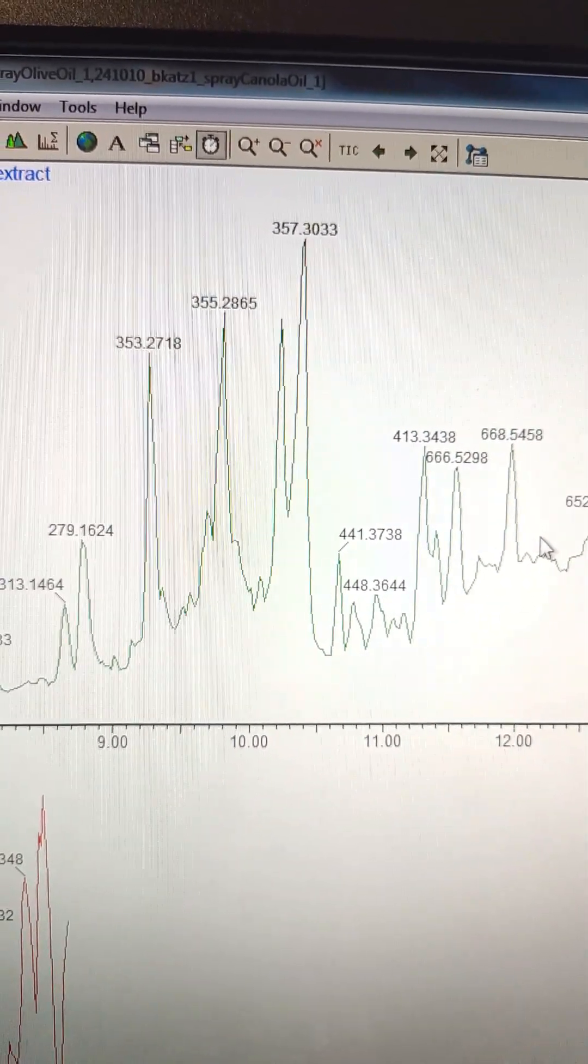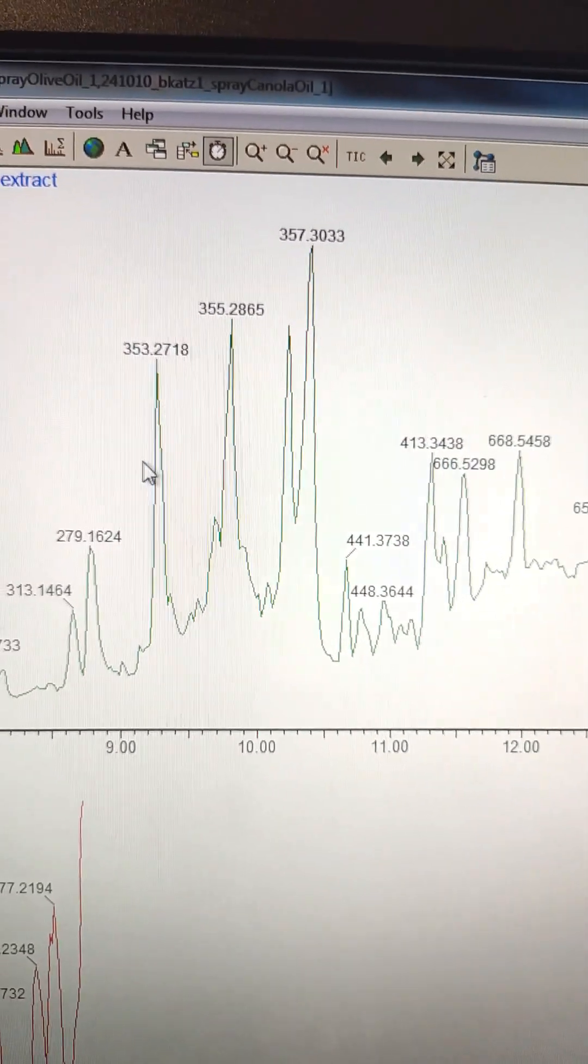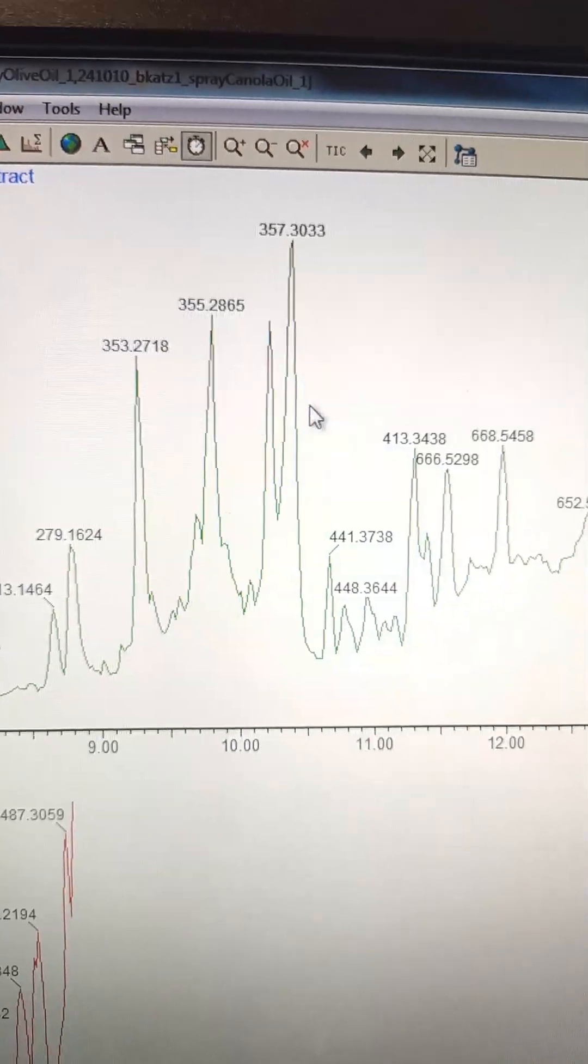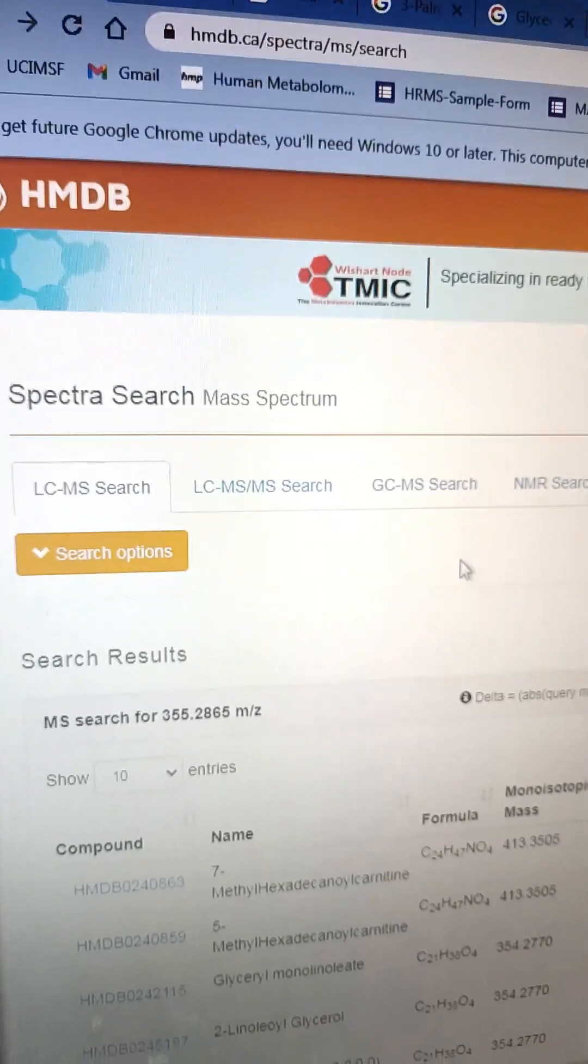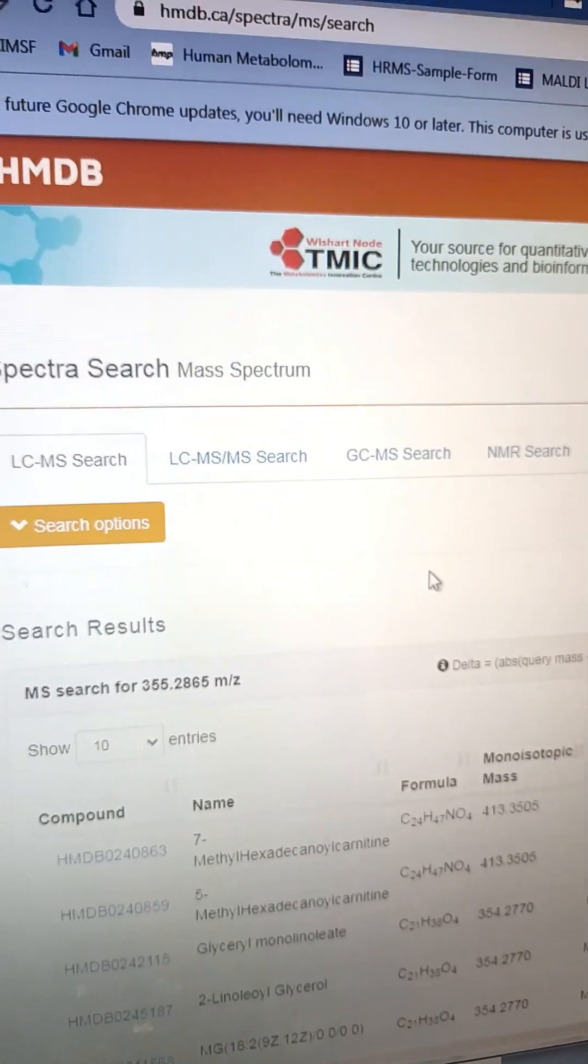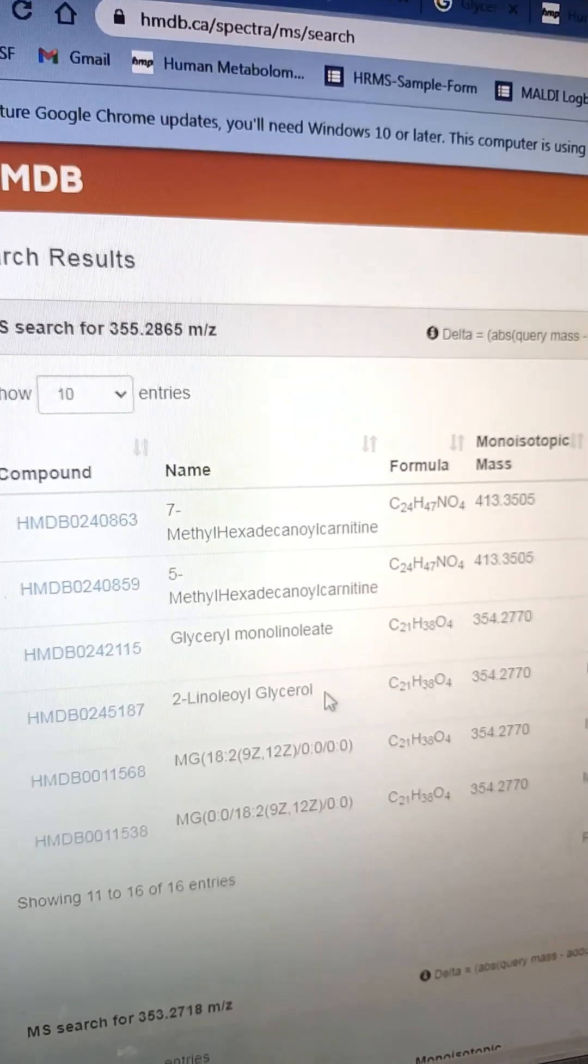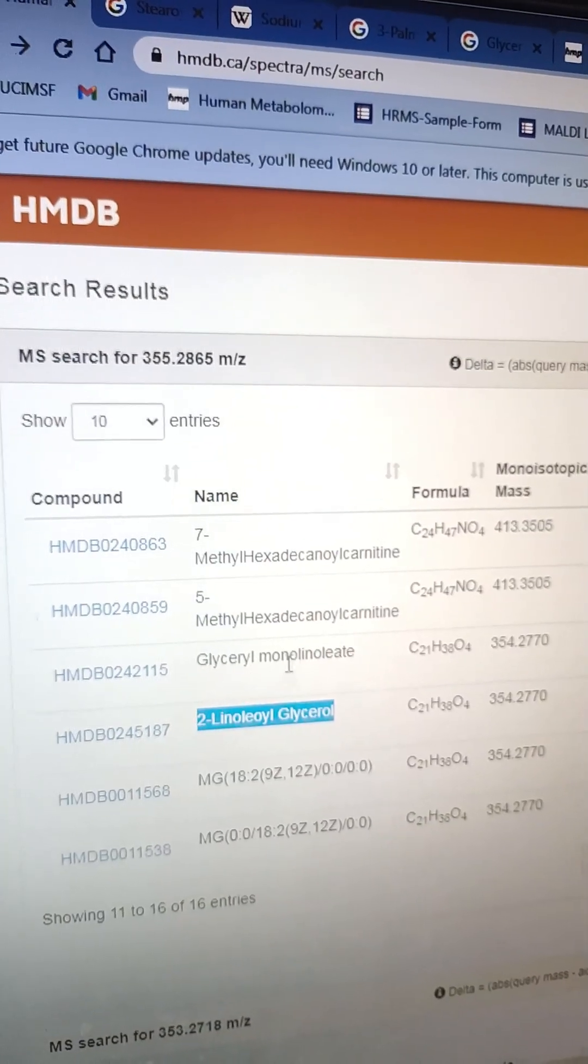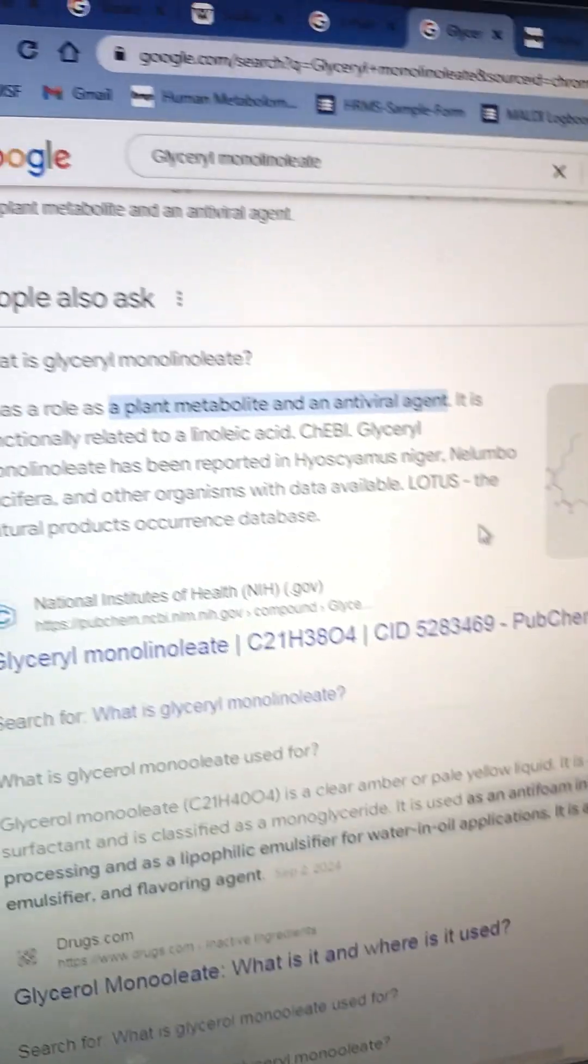It's an FDA-approved food additive. So we are looking for this guy particularly. Here's some of the canola oil data on top. I'm not going to search through everything. Maybe I will send through untargeted and get a big list. Let's look at this 353 and this 355 and this 357. And then we're going to search this in HMDB.